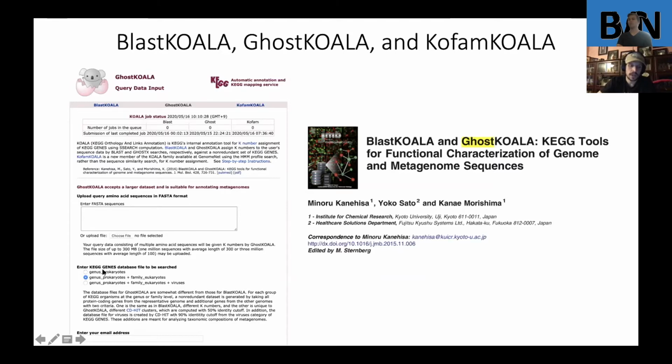So if you have bacteria or archaea, you choose the prokaryotes, or you could choose prokaryotes and eukaryotes if you don't know what you have in your sample, or you could go even more broad than that and include viruses in there.